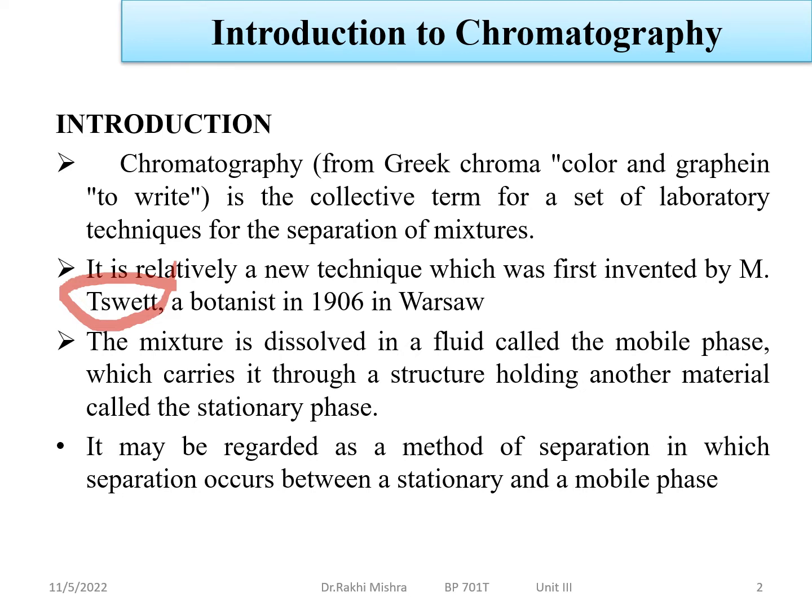It is a collective term, because different types of chromatography exist. It denotes a set of laboratory techniques used for the separation of mixtures. Why is the word laboratory used? Because this is the most common technique that can be used in your routine work, in your laboratory experiments, and in your research work.